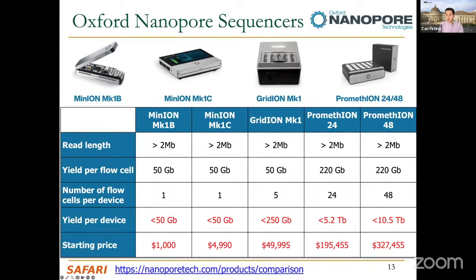We're going to be covering the benefits of these Nanopore sequencing technologies soon. But I wanted to mention that maybe you already have seen one of these machines but you're not aware of it. The Nanopore sequencer technologies also have different machines or devices in different categories.